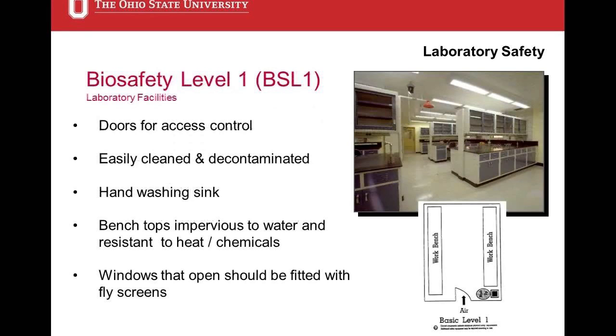We don't want genetically modified organisms that shouldn't be in the environment out into the environment, and insects can carry those things back out into the environment. And then who knows what will happen to it once it gets out in the environment. We want it to stay within the lab. So most of the newer, or all of the newer lab buildings, at least here on campus, the windows don't open. Some of the old buildings, they do. So if you happen to work in a building where the windows open, we don't have a problem with them being open as long as they have a screen in them.